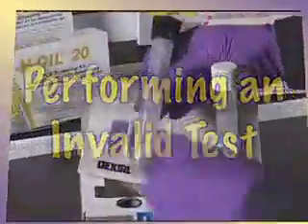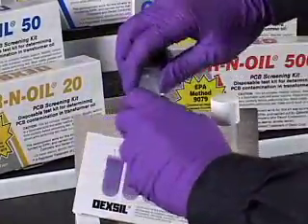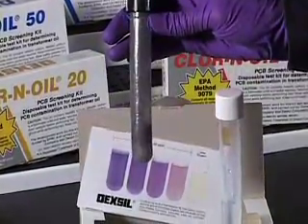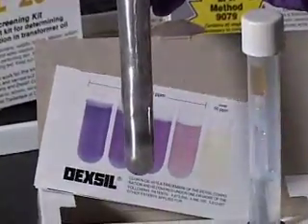Performing an invalid test. If the solution appears a light gray that rapidly turns clear in the bottom of the tube, this is an indication that the sample contains too much water and the test cannot be completed.